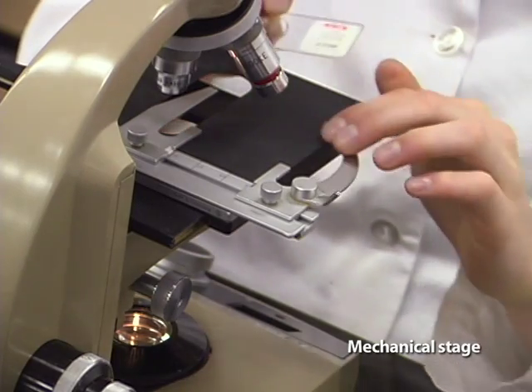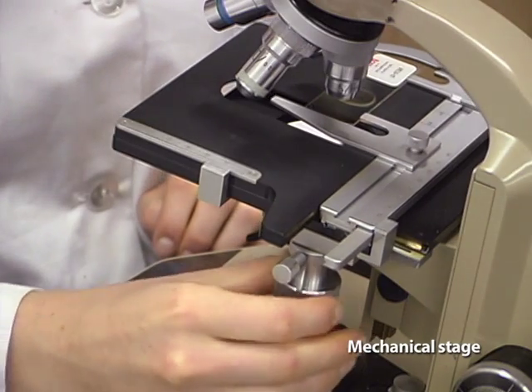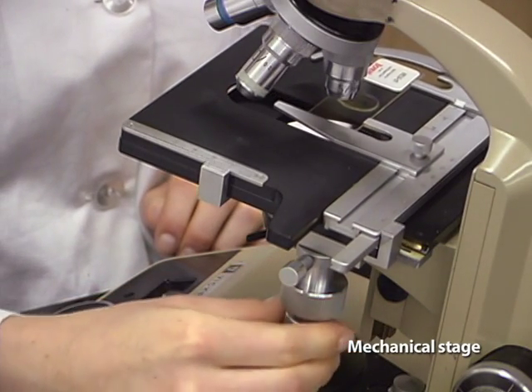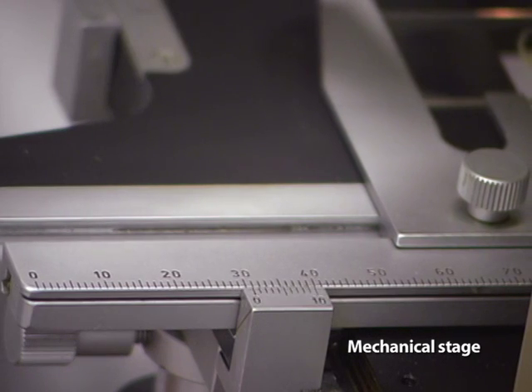In advanced compound microscopes, a mechanical stage is used to hold a microscope slide and move it from side to side and back to front. With the numbers on the side and back of the mechanical stage, you can repeatedly find the exact position of an object on a slide.